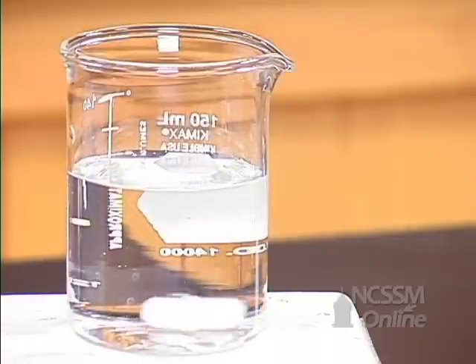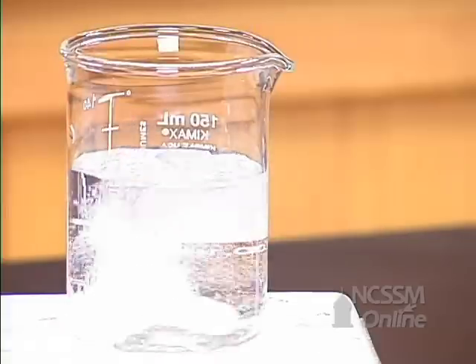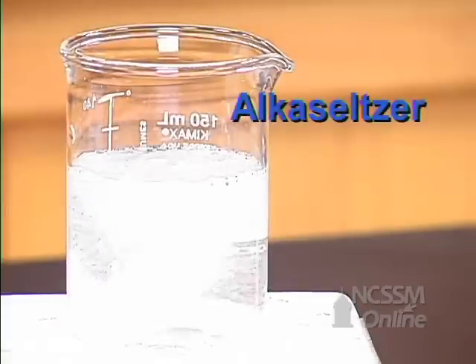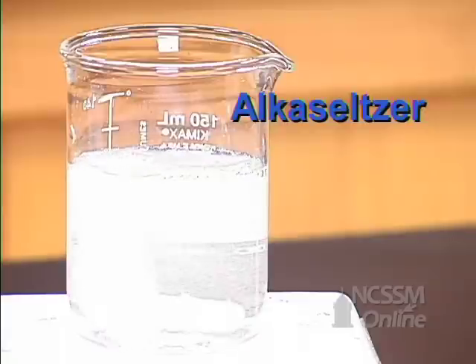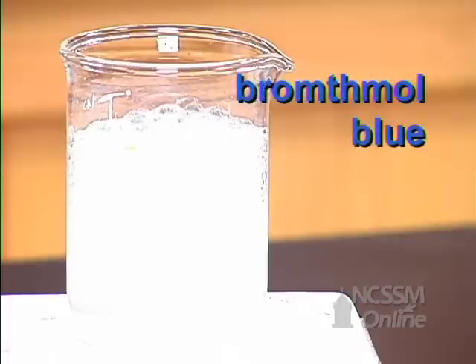I'm again going to start with 100 milliliters of distilled water, and I'm going to add an Alka-Seltzer tablet. I'm also going to add a couple of drops of bromothymol blue.